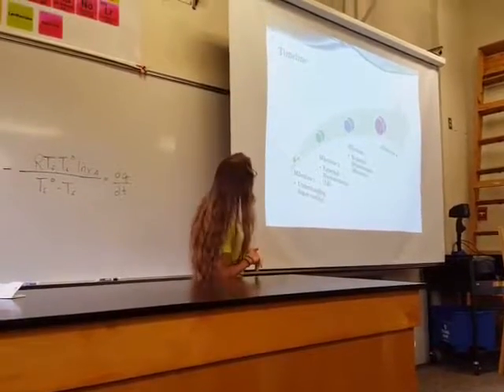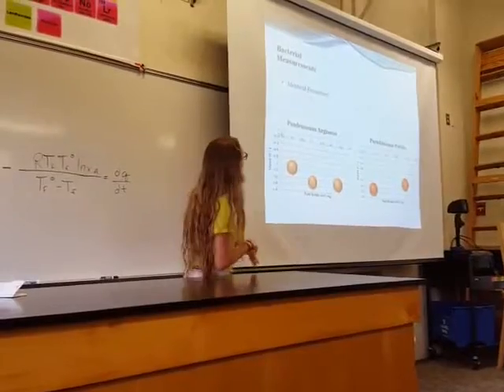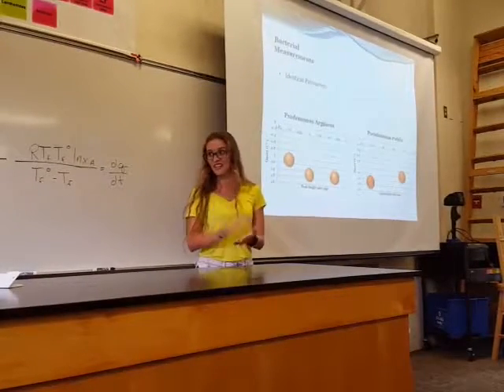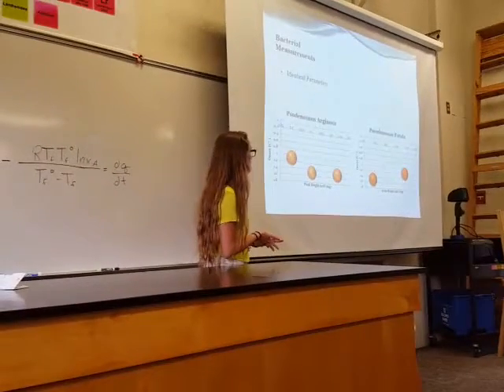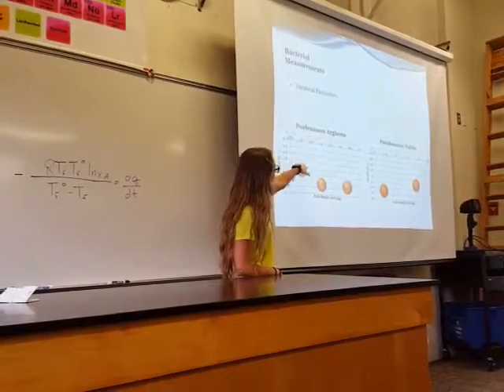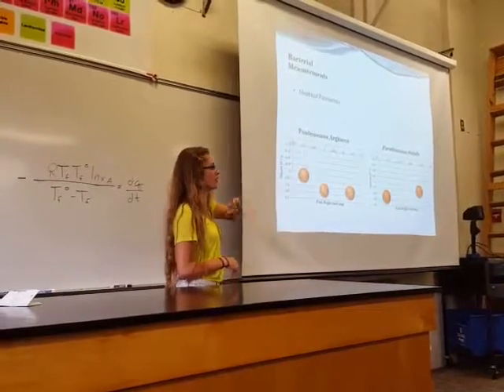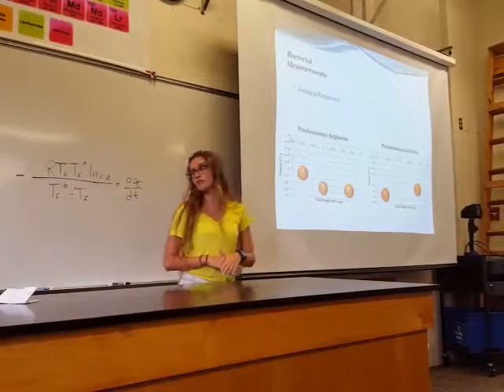bacteria. And so what we found for bacteria, using identical parameters, is we did 2 separate kinds of bacteria, and we would have done more, but I ran out of time. And so I am hoping to do more of this, or hopefully someone will continue this. But we did Pseudomonas aeruginosa and Pseudomonas putida. These were run on the differential scanning calorimeter the exact same way as LB, with the same amount, same parameters and everything. And these were the graphs that we got for those.